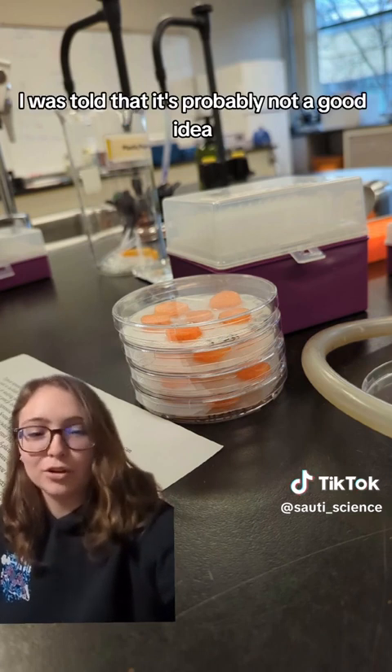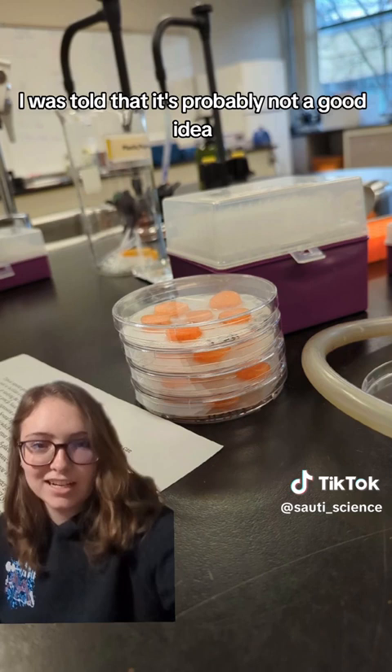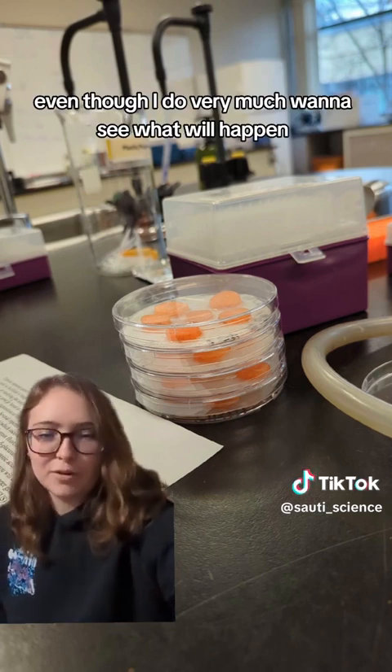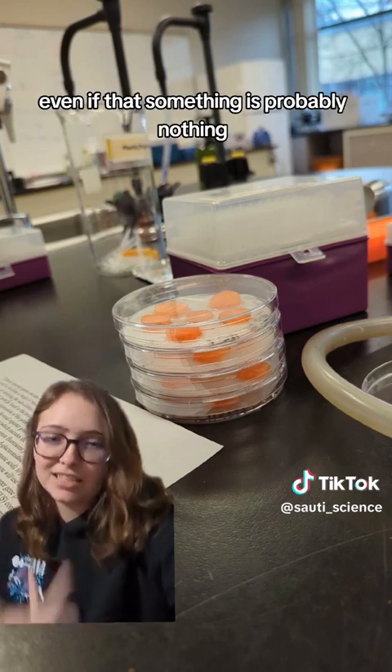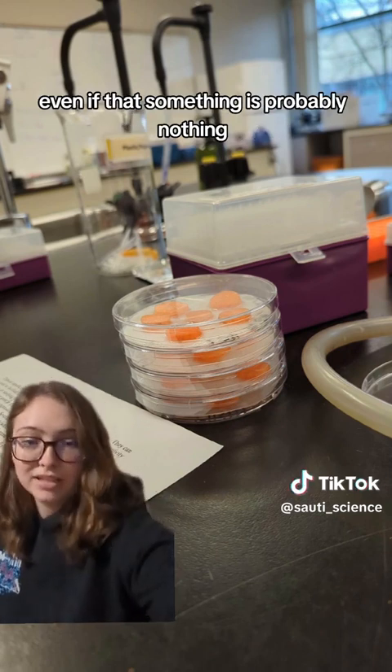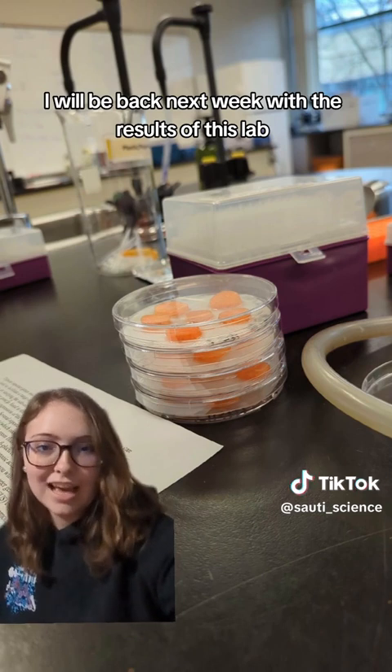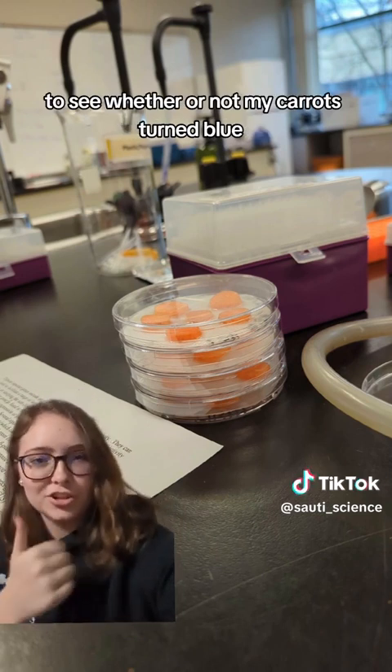Despite all that, I was told it's probably not a good idea to eat the transgenic carrots, even though I very much want to see what will happen — even if that something is probably nothing. Either way, I will be back next week with the results of this lab to see whether or not my carrots turned blue.